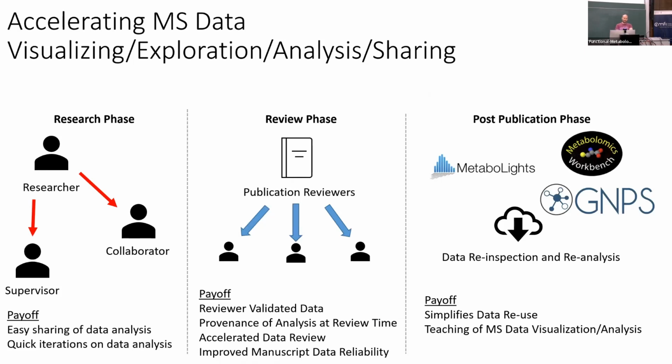Okay, so I hope I can convince you with that the dashboard may facilitate a little bit your day-to-day data inspection during the research phase. I think it's really nice to use it for the review phase, to be transparent with the reviewers and also later on the readers, and put these URLs right into the SI.